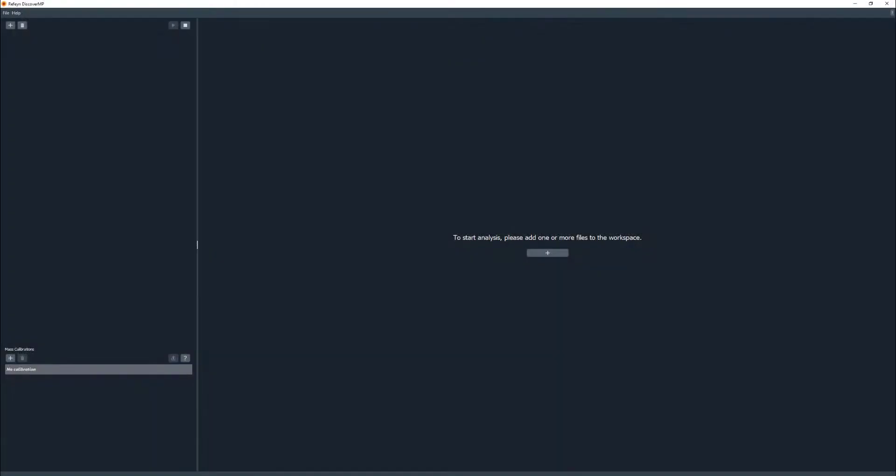Once Discover MP has opened, there are not many things that you can do until you have loaded the measurement file. You can open a new file by selecting the plus on the main panel or the top left panel, and then select the files you want to open.